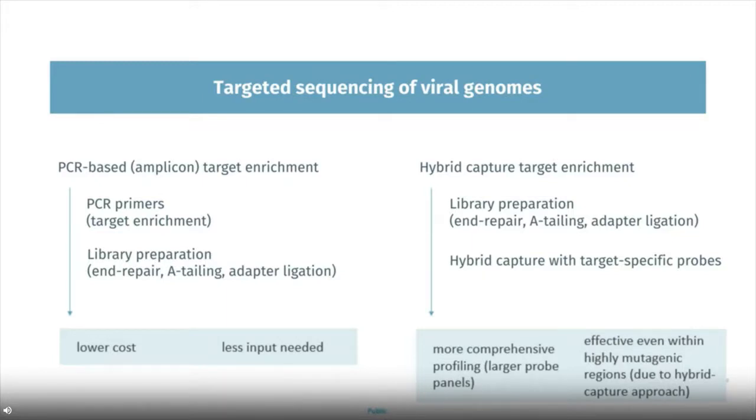However, in scenarios when the genomic sequence of the virus of interest is already known, a targeted sequencing of viral genome can be implemented. Clearly, as opposed to the metagenome approach, targeted sequencing is a less data-intense approach.